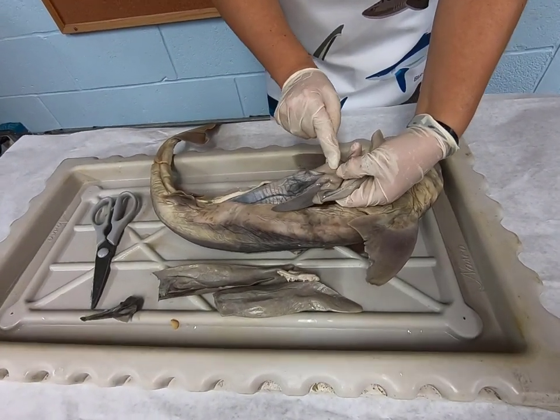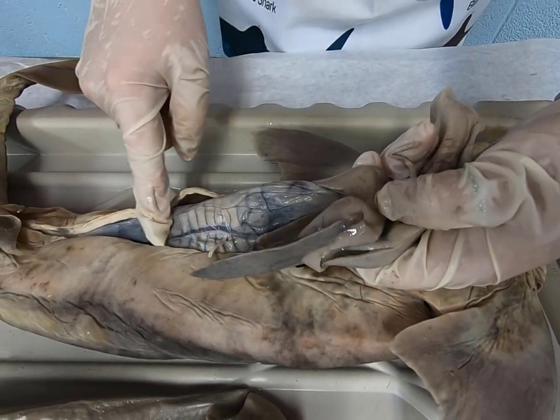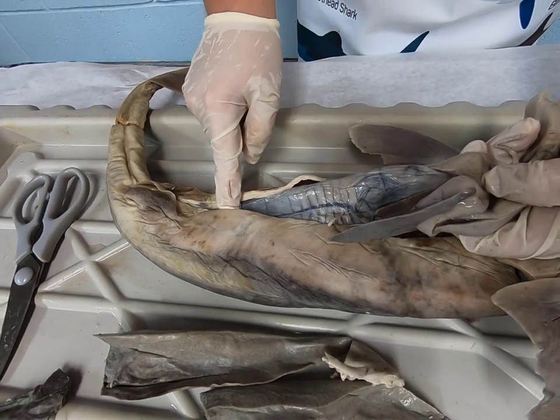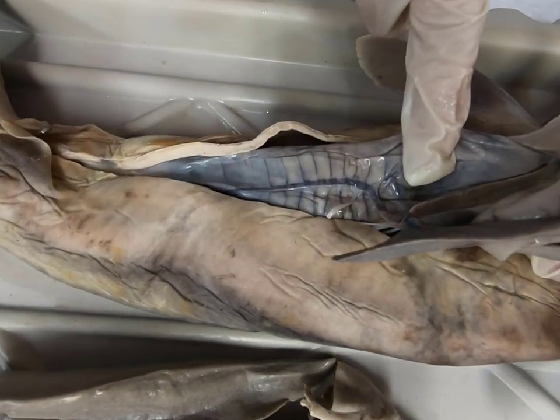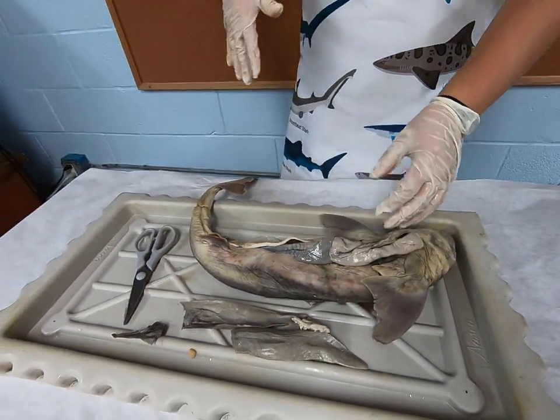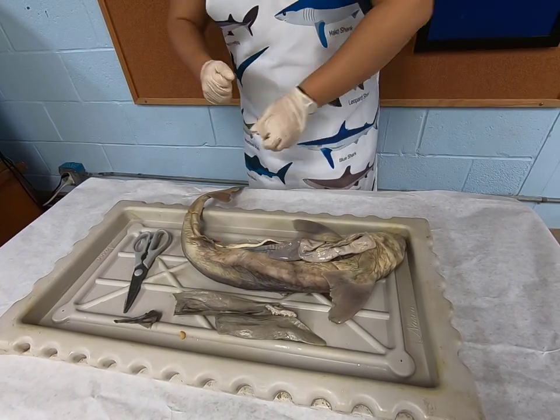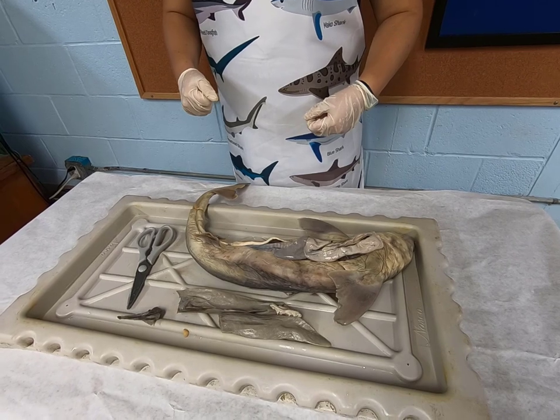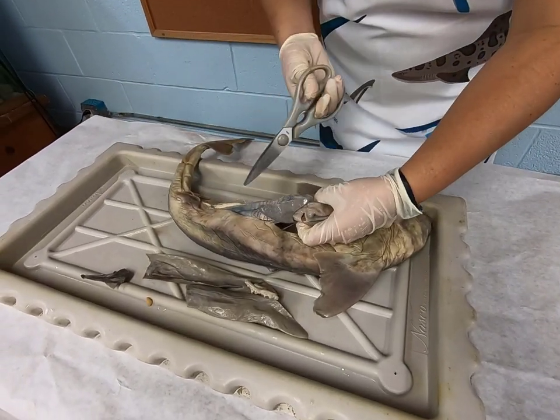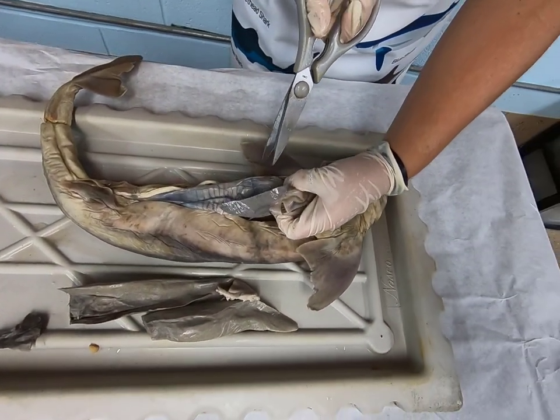We have the pancreas right here. And all right here are our intestines. Now, for our intestines, if we think to our body, we have these rows and rows and layers of all these intestines, almost like long, long, long intestines that are all filtered through our body. And we have lots of space in our body for that, and it takes up a lot.